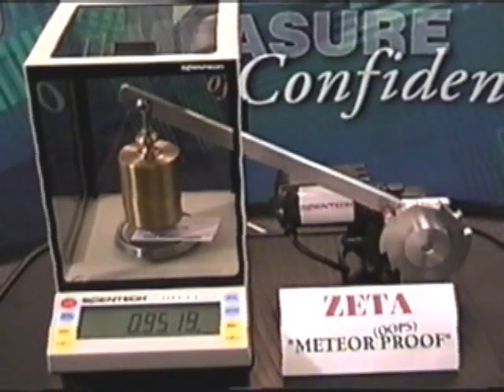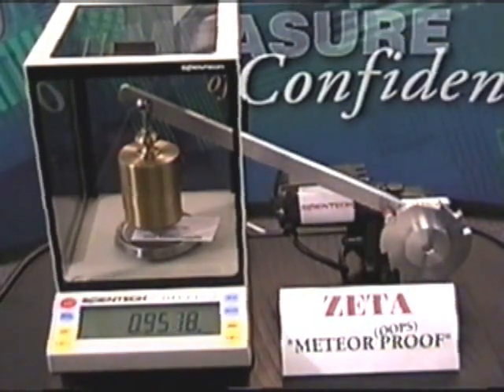Here we have a business card placed on the weighing pan and it weighs 0.9514.